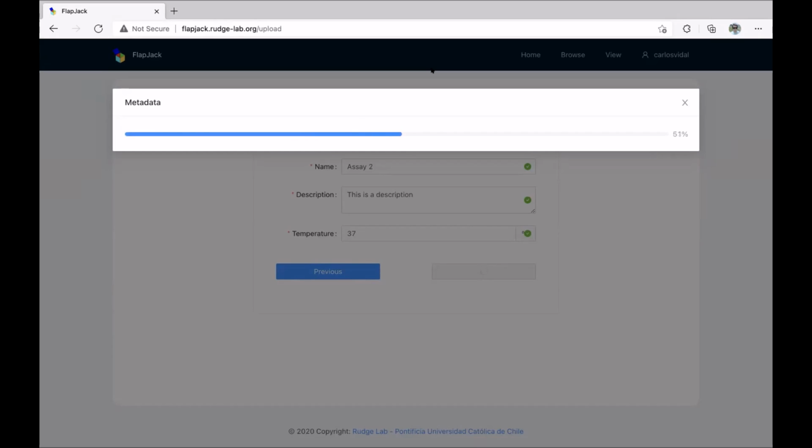Yeah, it's a pretty cool piece of software. Thanks a lot. As you can see, it has many features. It's not finished yet, but what I think is that we made a pretty strong basis, pretty modular. We use pretty good full stack web development tools, so it's pretty easy, I think. We think to start building on top of the existing Flapjack in a modular way.